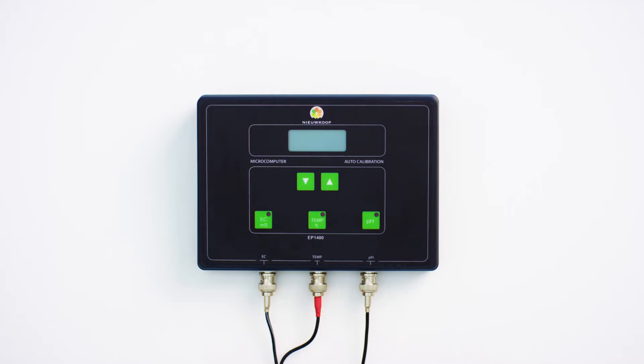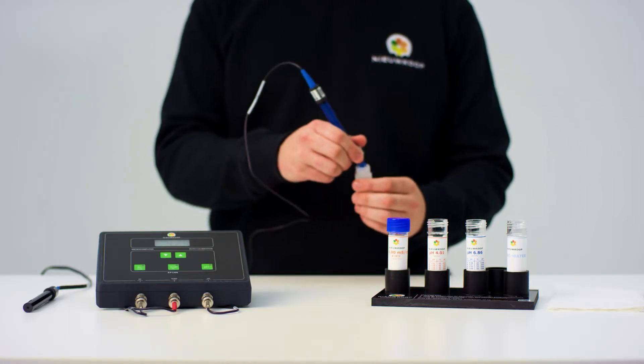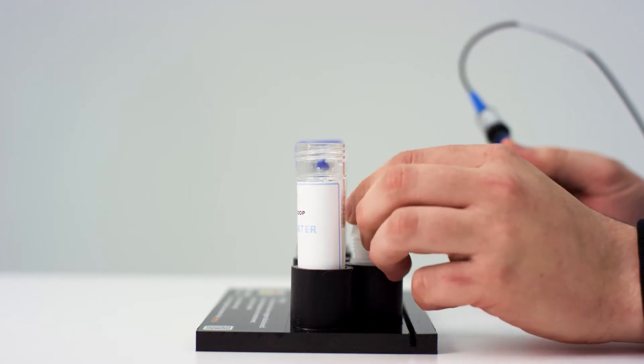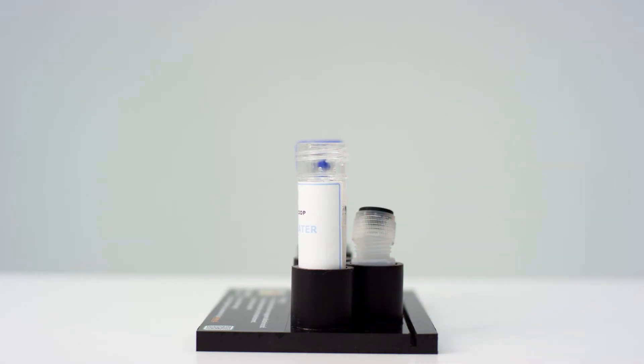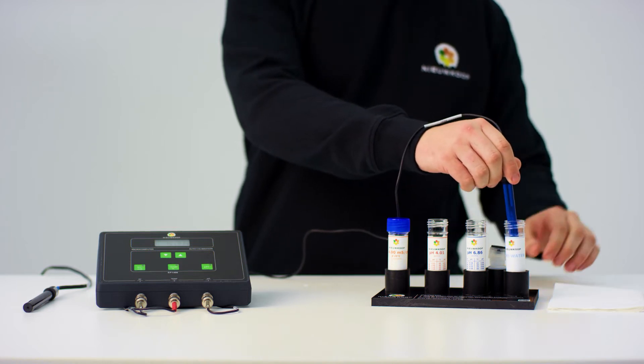We will start calibrating the pH, so press this button to turn on the instrument. The measuring instrument has an automatic calibration, which means that the liquid is recognized during calibration. You need to calibrate the instrument on two points: pH 6.86 and pH 4.01. Start by removing the protective cap and placing it in the holder on the calibration station. First, clean the sensor with demineralized water and then dry it. Do not touch the glass bulb while doing so.